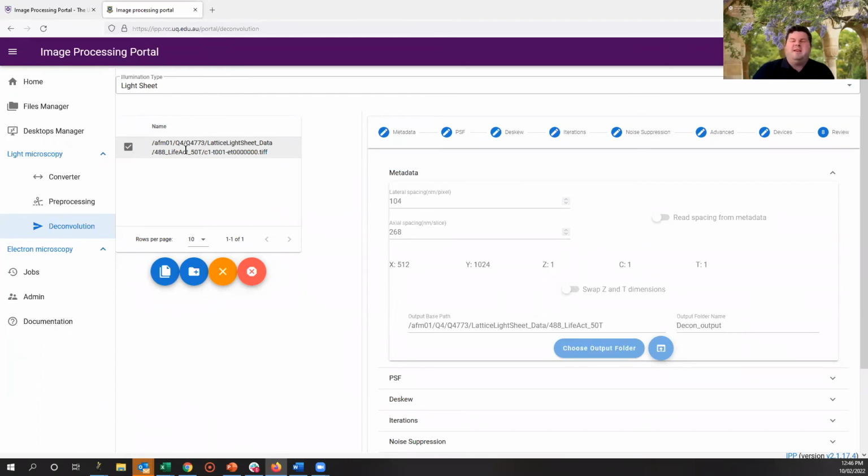But yeah, more or less you can. Most of the settings are the same. With the Lattice, you can change lots of parameters. It's really capturing the PSF that's matched to those parameters, because that's going to be the biggest effect. Things like the de-skew angle are not going to change from session to session. The number of cycles, you can either define it, or depending on the deconvolution engine, you can say keep going until it reaches a cutoff that it's determined.